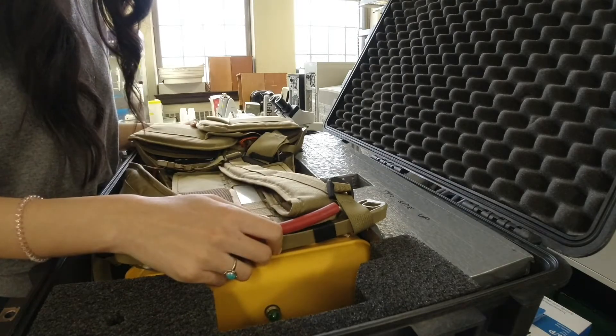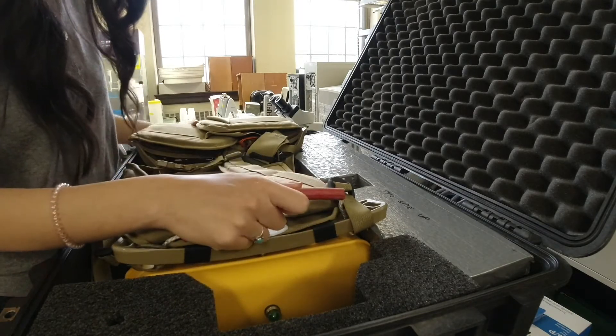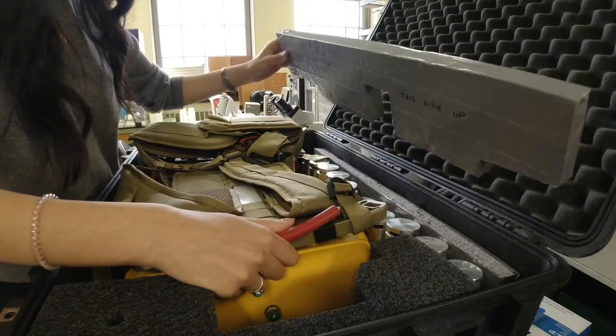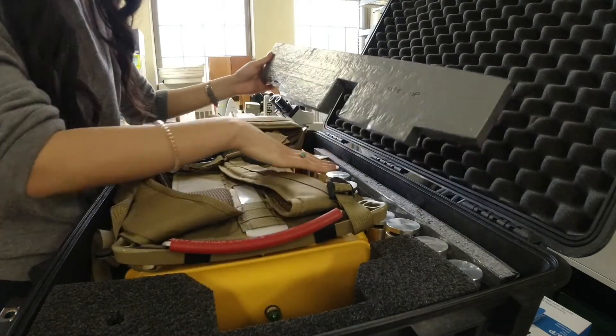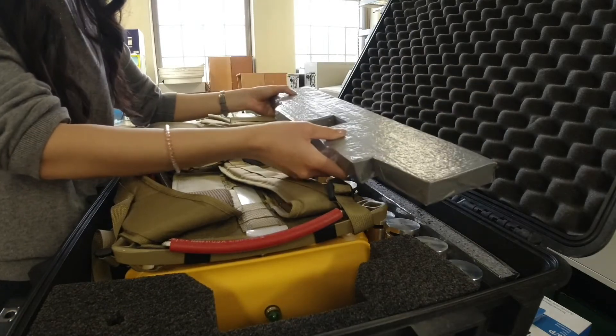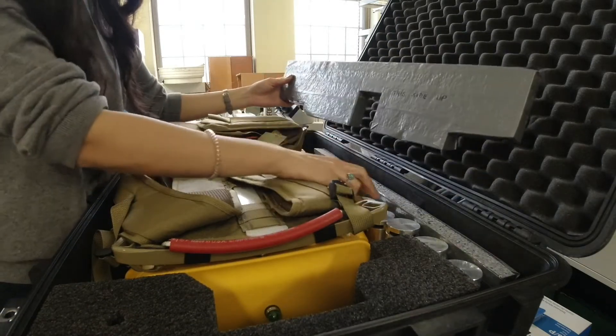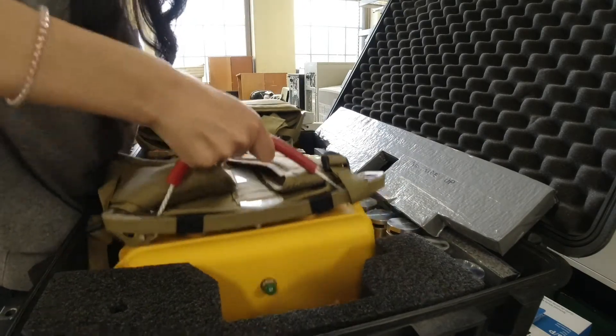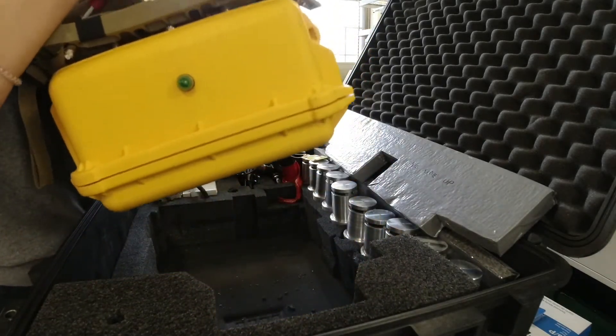The backpack has a neat way of taking it out using this red strap over here and by putting one hand underneath. This protective cushion is for the filters when they're being transported so nothing gets damaged along the way. Lift with one hand underneath the bag and take it side to side, then straight out.